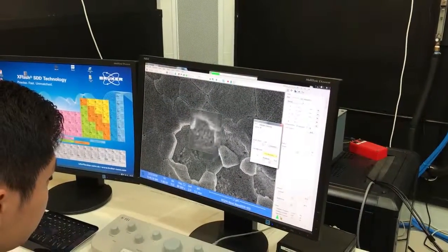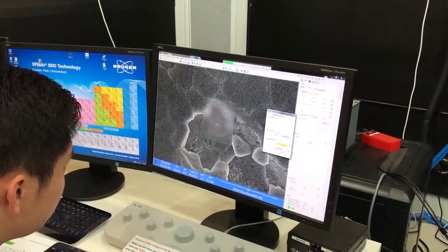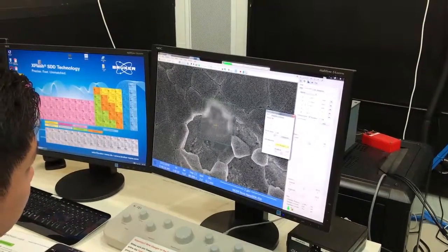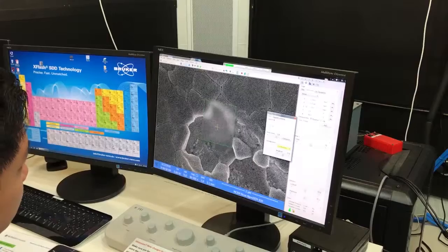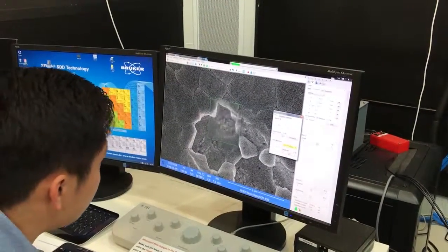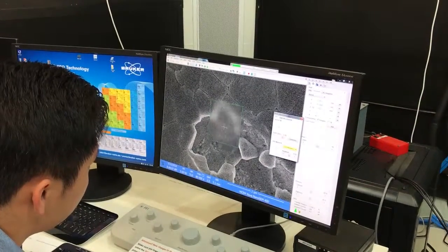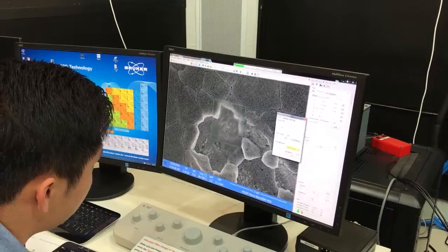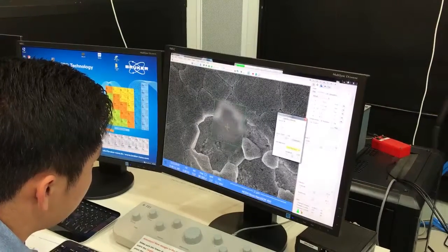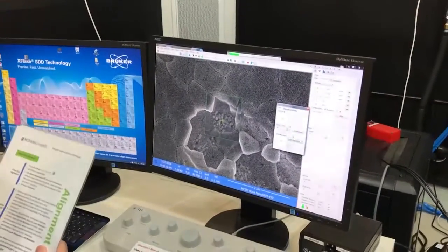So that's wobbling in and out of focus, but that's also changing the position, and so what he's trying to do is get it nice and still so that it goes in and out of focus without movement. It's almost there, but just a little bit. Looking pretty good actually now. Oh, that's spot on almost. Okay. Yeah, that's very good. Okay, so we are done with the lens alignment.